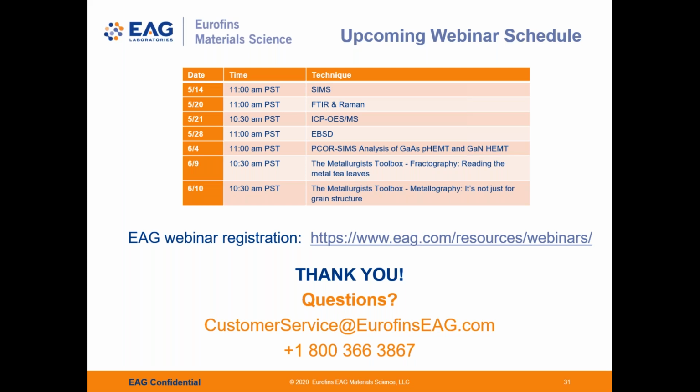We will experience some charging if, say, we hit a piece of glass with the ion beam. We do introduce some charge, but we have ways of mitigating this issue by surrounding the area of acquisition with conductive material, and that almost always mitigates the charging effect. So we essentially don't suffer from charging effects. Insulators or conductors, we are able to measure both.